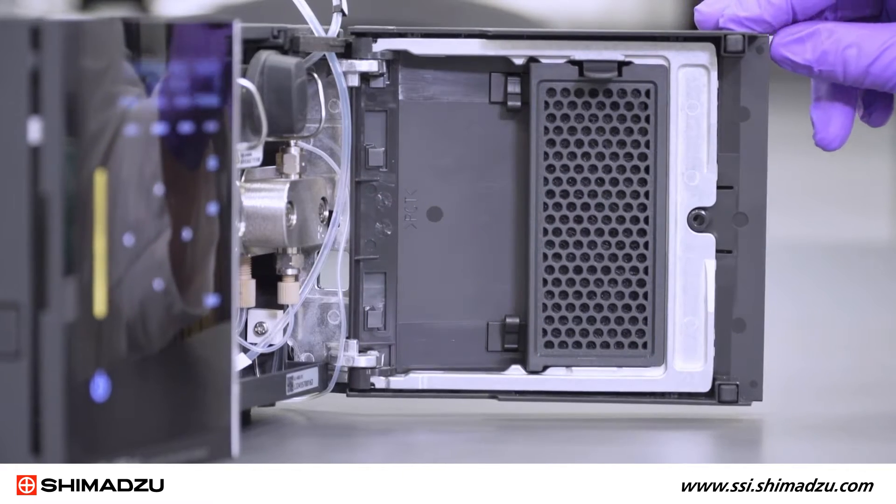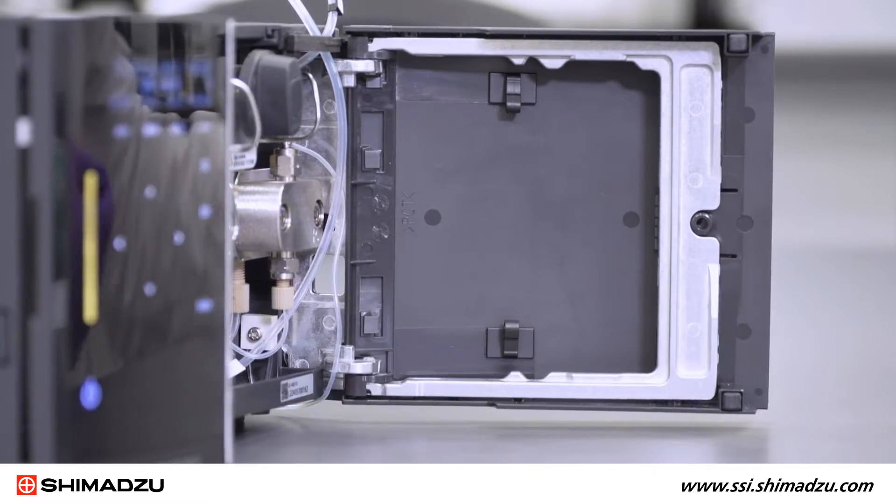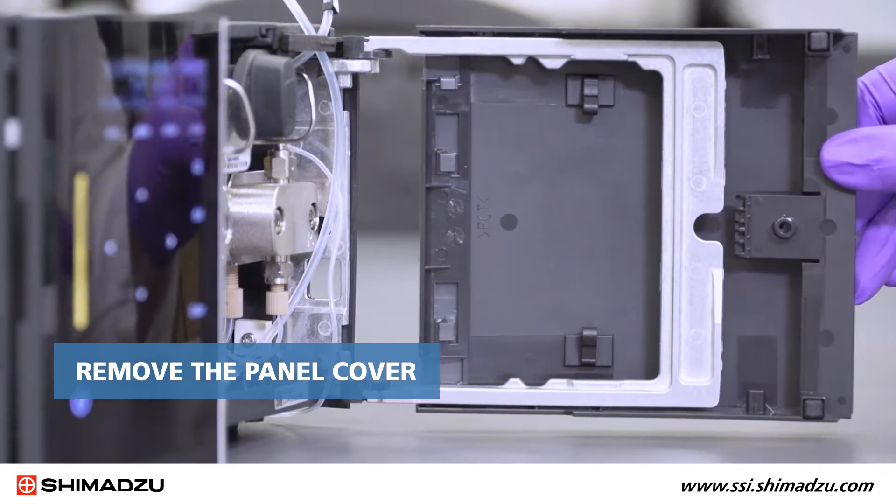Open the right pump door. Press the tab at the top of the filter holder and lift it out. Remove the panel cover by pressing the projection at the front of the panel and sliding it forward.